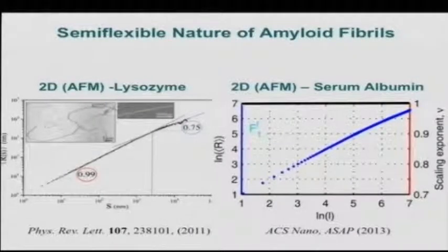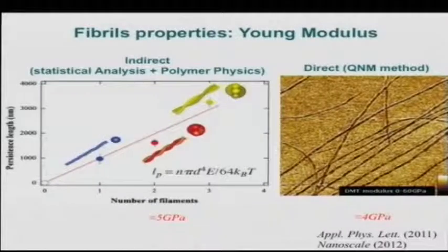Again, okay, this is a log scale. This is a log of the contour length. You see one slope here. You see another slope here. And if you work out the fractal exponent, this is how the fractal exponent is evolving. You see, if the system is long enough, you go back to 0.75, and the way you get there is really with a plateau, which tells you that you really have reached self-similarity. So this system really behaves like a polymer, like any other polymer would behave in 2 dimensions. So this is the first thing I want to bring up.